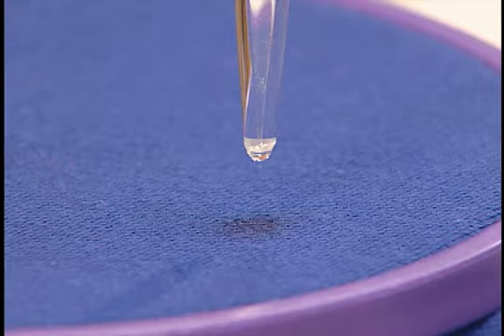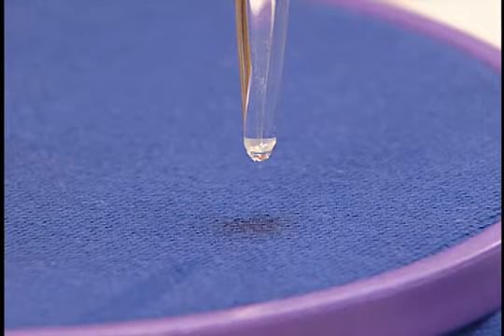The significance of Test Method 79 is that the test results indicate whether a fabric will hold water on its surface or take water into the fabric. If the fabric does not move water through its structure, as related to moisture management properties, then movement and drying cannot be measured.